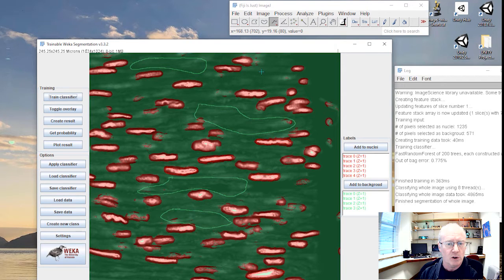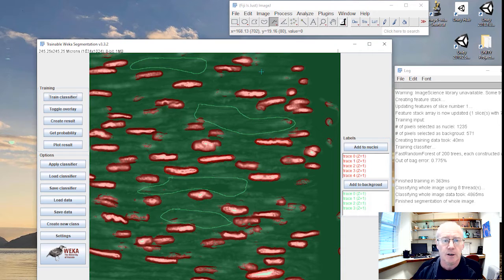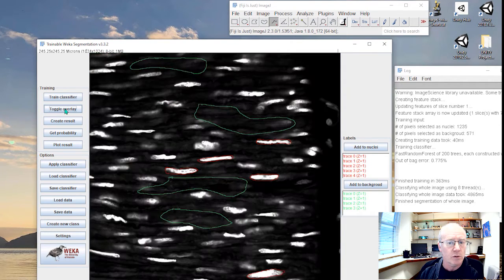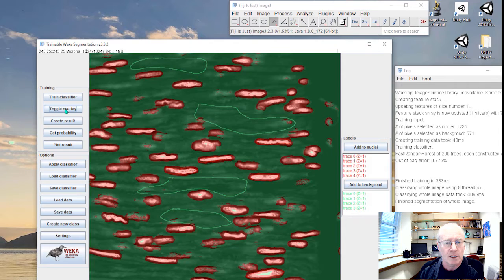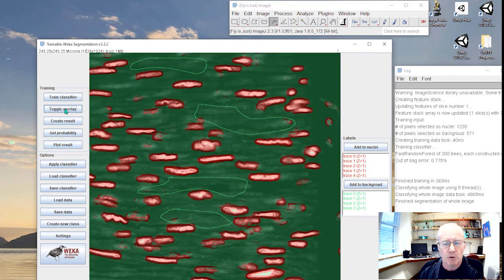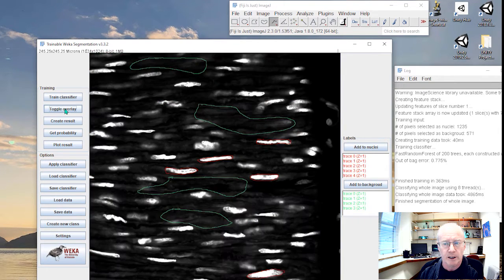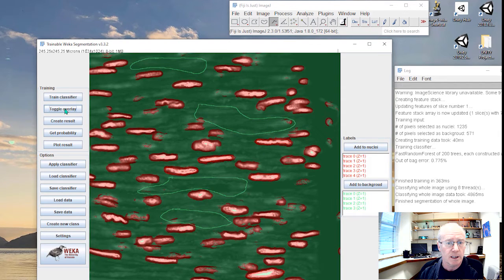Now we could further enhance this. We can toggle between them two. So here's our image and here's our segmentation. So remember red are nuclei, green is the background. It's done a pretty good job. I think you might agree.